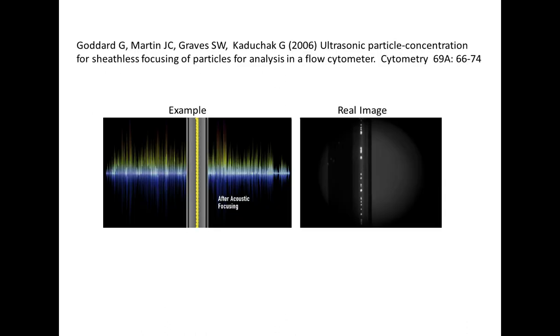Speaking of improved hardware, I'd like to present some results that I'm very pleased with. Here's a reference to a paper by Goddard et al. on acoustic focusing cytometry. This is a technology where acoustic energy is directed into the flow cell in such a way that the center of the stream is a volume where the waves cancel and there is an energy absence. Thus, the cells move to the center, and once in the center, they stay there. This is illustrated in the next few images by an illustration on the left and a photograph on the right.